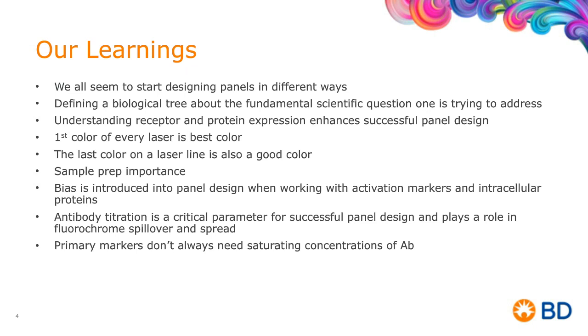One of the other important learnings that we've had too is that the laser lines, and the last color on the laser lines, are very critical colors too. And again, it's part of that story that's unique to every laser line.